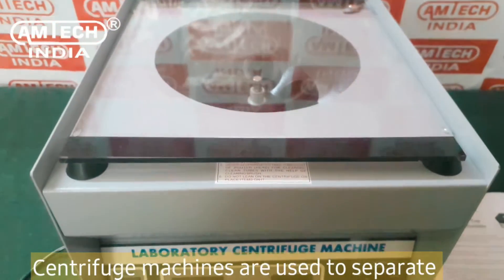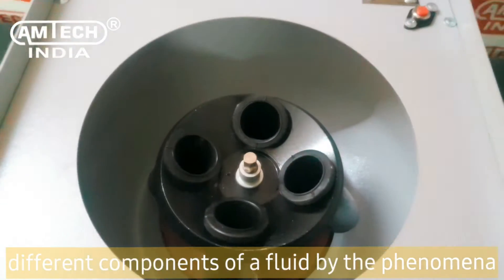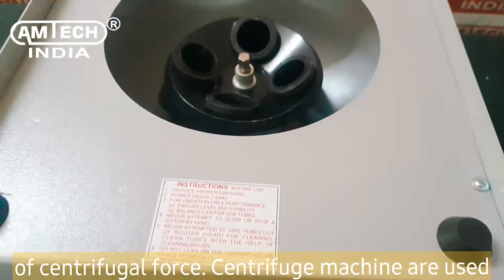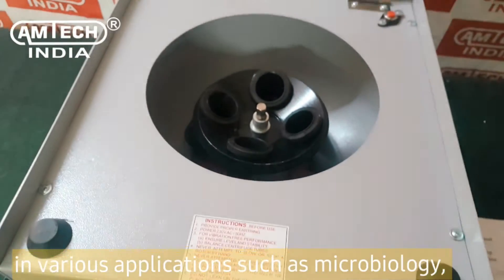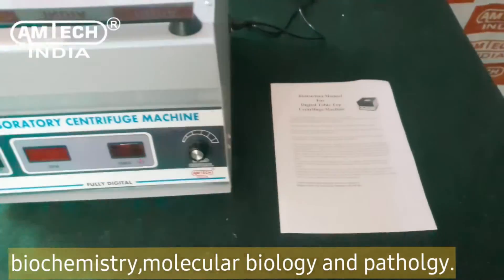Centrifuge machines are used to separate differing components of a fluid by the phenomena of centrifugal force. Centrifuge machines are used in various applications such as microbiology, biochemistry, and molecular biology and pathology.